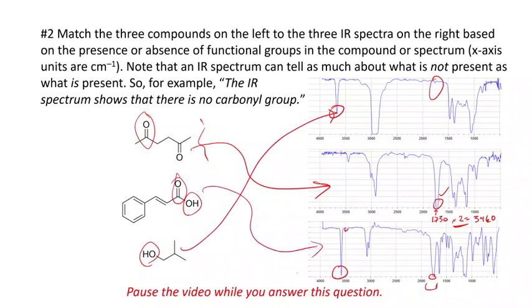Now, I want to say something about the carboxylic acid group. This really surprised me when I saw this spectrum because it's quite rare to see carboxylic acid with such a nice sharp peak. Typically, a carboxylic acid will look something like this, just a really broad peak. But I guess it's possible to have them look like this. All right, see how you do that?